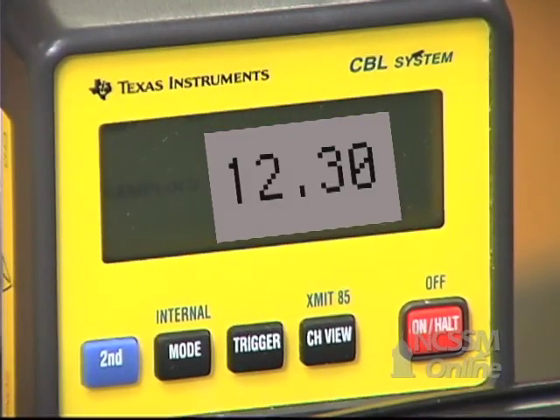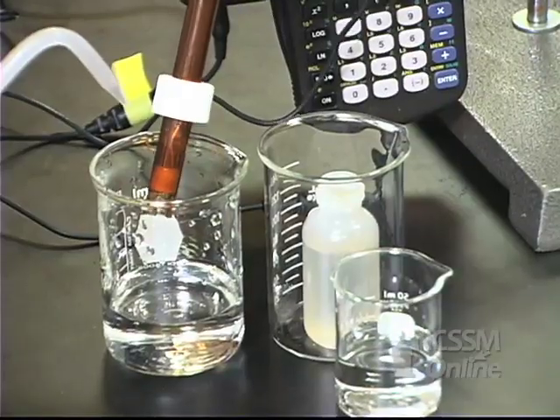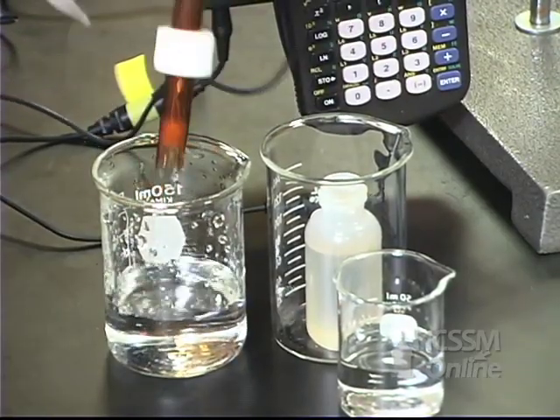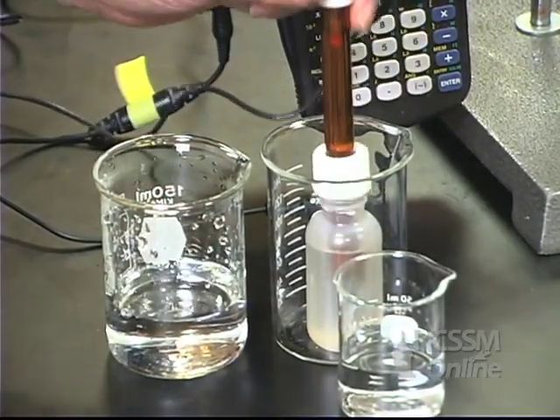I'm going to read the pH from the CBL screen. Then I'm going to rinse off the probe and return it to the storage solution.